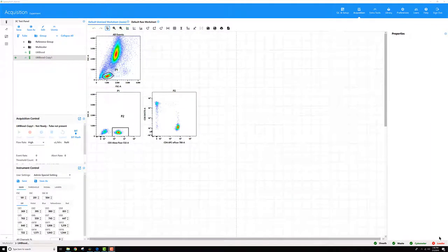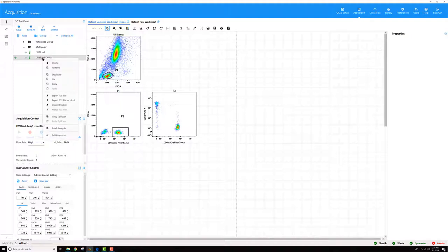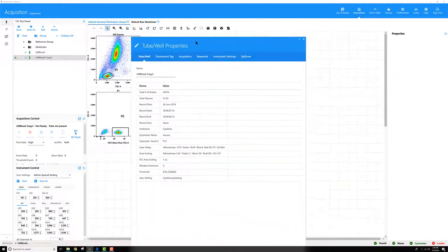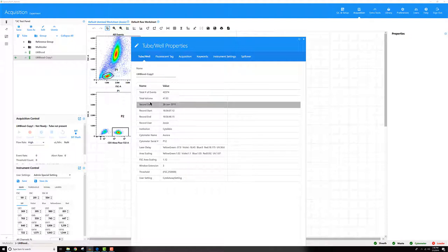To see the values that are recorded for each tube, simply open your experiment and right click on the tube or well that you want to look at, go to Edit Properties. You can see here on this first tab, tube slash well, there's a total volume parameter.